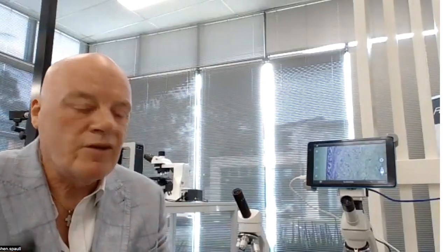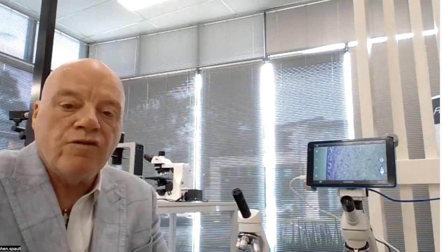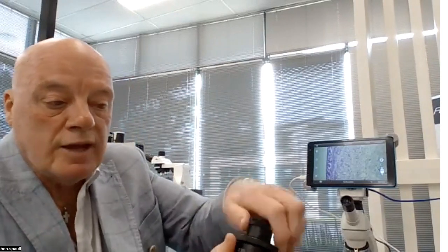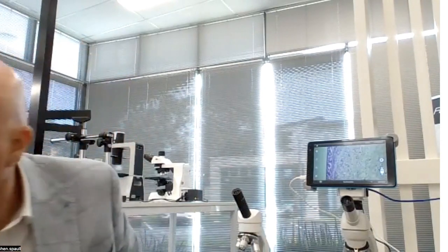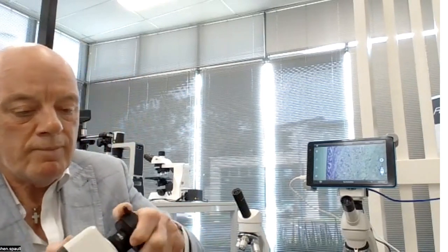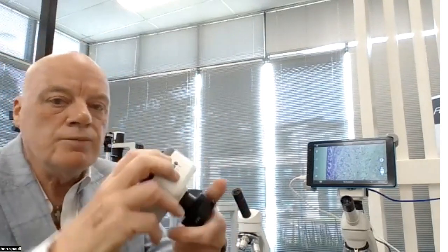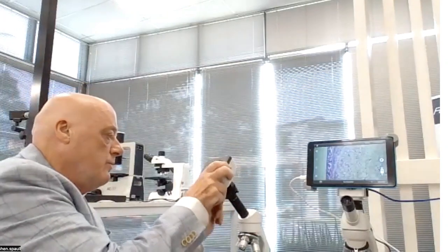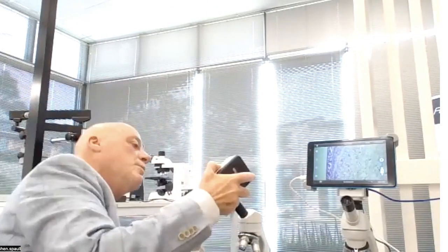A lot of people think they fit in the eyepiece. They actually fit over the eyepiece. So basically what you do is you connect your focusable lens, then you connect it to an eyepiece adapter by screwing it in that way. Once that's done, then you can screw your camera onto the bottom of that. Once that's fixed, partly screwed on, you can attach it then to your monocular microscope. And that will then connect up and you'll be able to take images like you do on the other ones. And you get a perfect image every time.